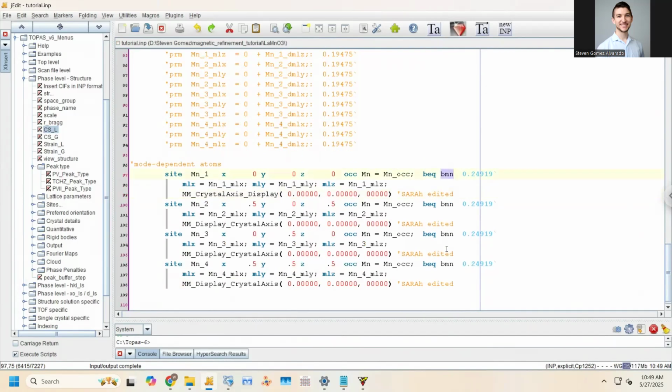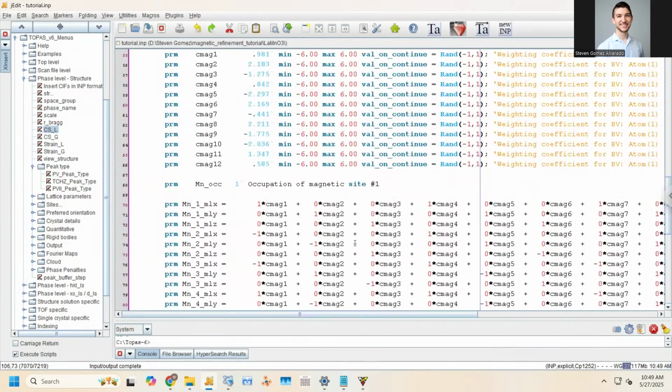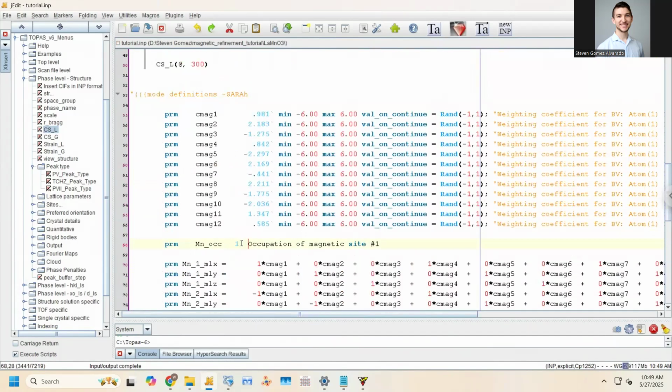This actually is incorrect syntax. You can't have the same variable name defined more than once. So I'm just going to give it a default variable name, the @ symbol. So anyway, you have to fix all those errors, and then even then, there's other stuff like this is supposed to be a comment, not a tilde or a little tick mark.